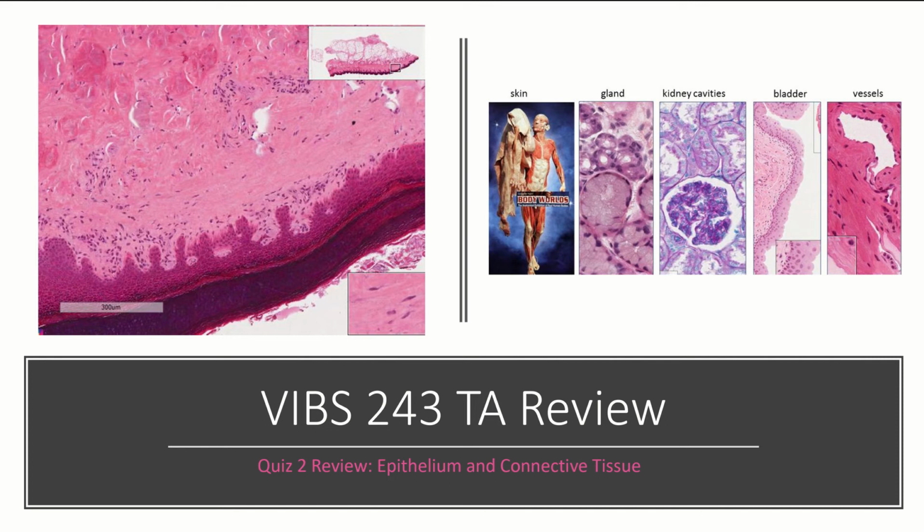And this week for quiz 2, what we're going to be learning about are 2 of those, epithelium and connective tissue. Hopefully by the end of this, you'll know exactly what we're looking at in literally all of these pictures, so make sure that you're able to do that. By the end of this, that should all be pretty clear for you.